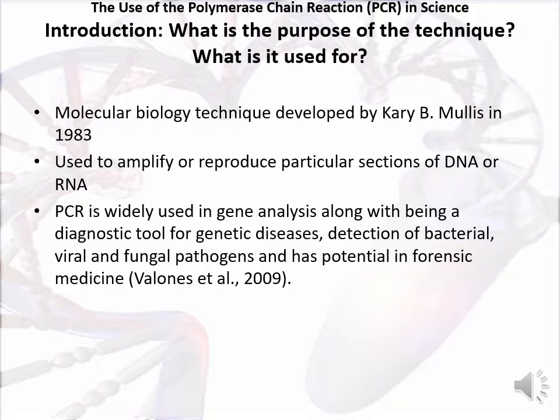It is a relatively easy process to perform, as it only requires a test tube, heat and simple reagents, and a DNA sample. The sample doesn't need to be uncontaminated or new to be successful in the replication, as PCR has worked successfully on DNA from tissue samples, human hair, dried blood, and even from tissues of a mummified brain.